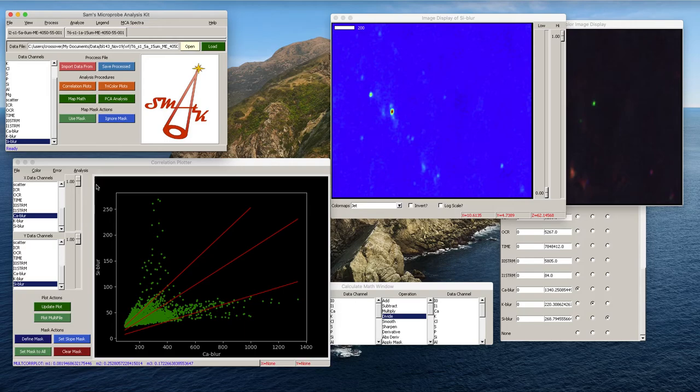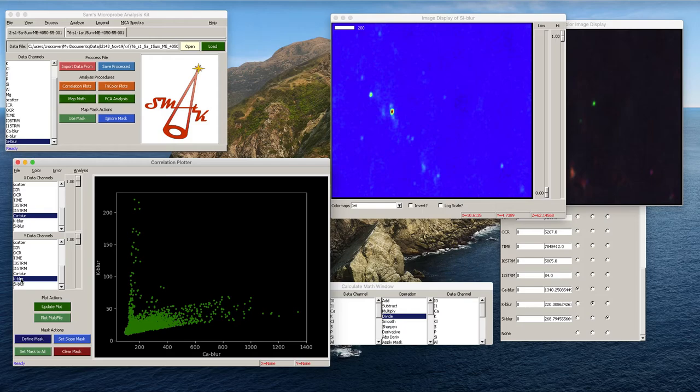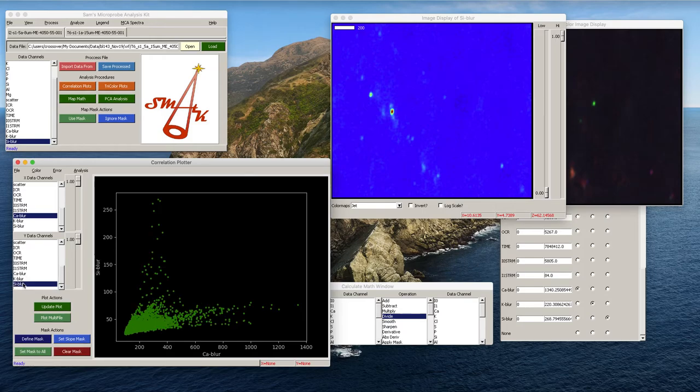Okay, if you want to get rid of these lines, you can just click off of that channel and then click it back again, and it'll update the plotter. You can export this data, so you can bring it into another plotting program and plot it up whatever way you want to present it. To do that, you would go File, and you would go Export the data.